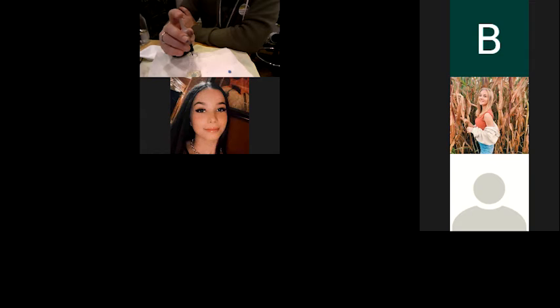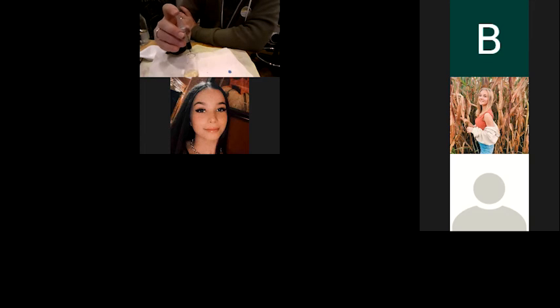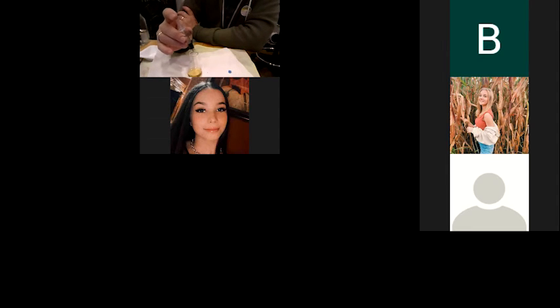Yeah, that yellow color is becoming a lot more pronounced now. So I definitely think we're going to get a nice green color rather than a blue. Oh man, it's getting really yellow, right? It's becoming a lot more obvious. So we're going to be looking for a light green color that, when you swirl it, doesn't change.